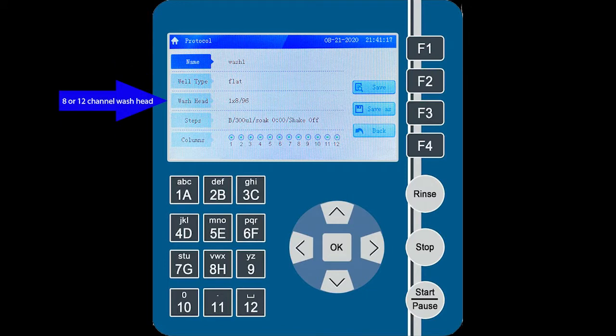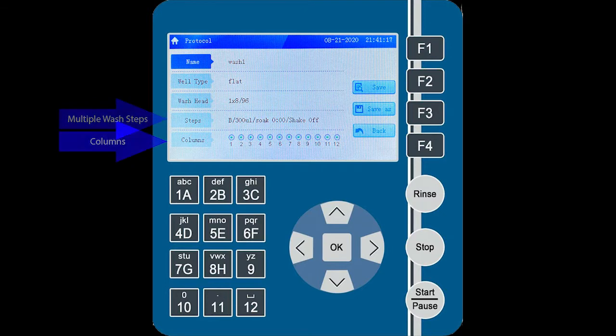After that, set up the wash program details, such as the number of wash cycles, soak time, plate shaking, and wash mode. Finally, choose which columns of the plate are going to be washed using the column step.